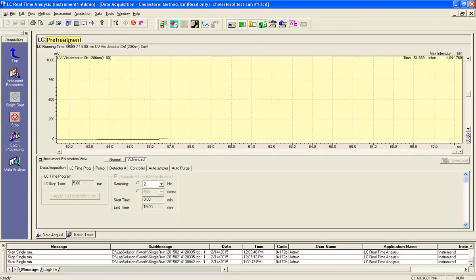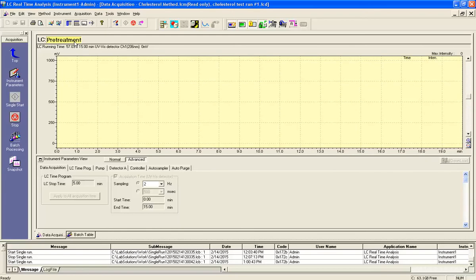When it has injected, you will see this pre-treatment icon go away. That means that it has now injected your sample. Your sample is running in the machine, and now we just saw that icon change. Not only that, but you saw a very clean chromatogram show up here again. It starts over with a clean slate. So a sample has been injected, it resets the computer screen, it starts back at 0, which means this is the initial time that we've injected a sample for you, and now a waiting game happens.